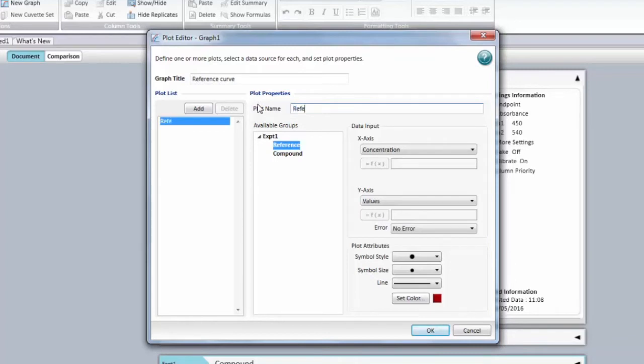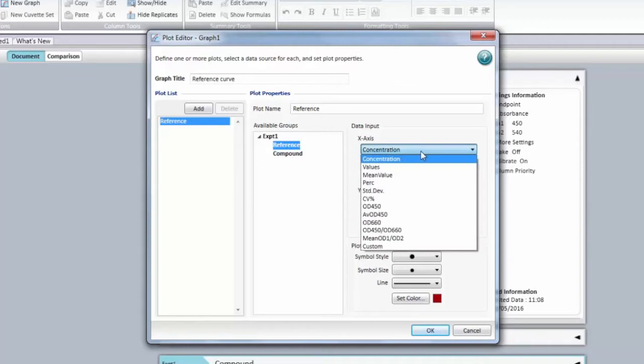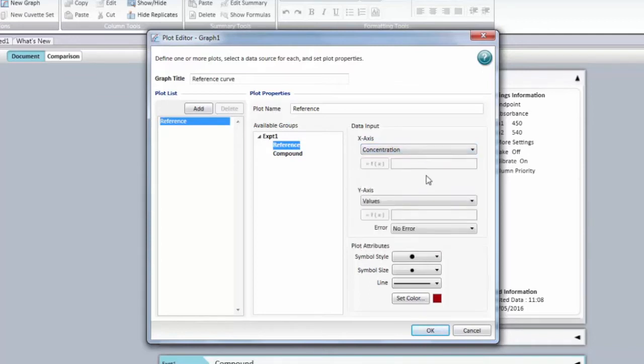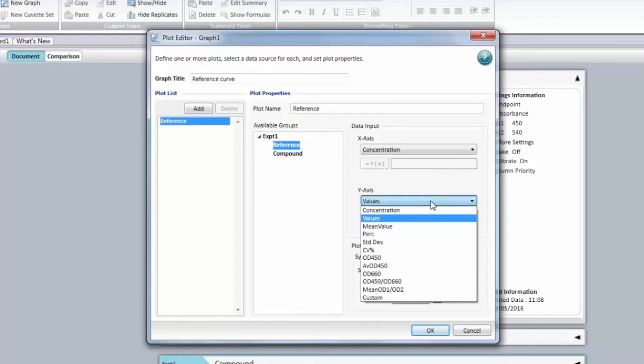So here we're going to rename that plot and you're going to be able to choose from the groups that are inside your protocol. Then you can choose a column from that group for the x-axis and a column from the same group for the y-axis.